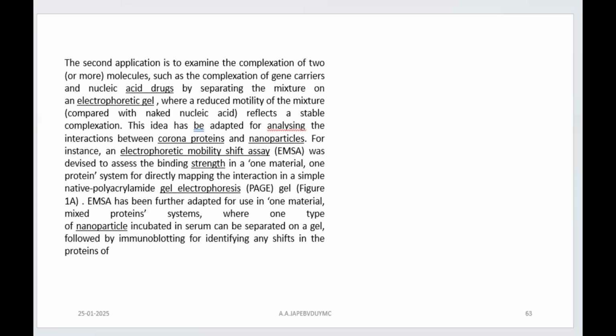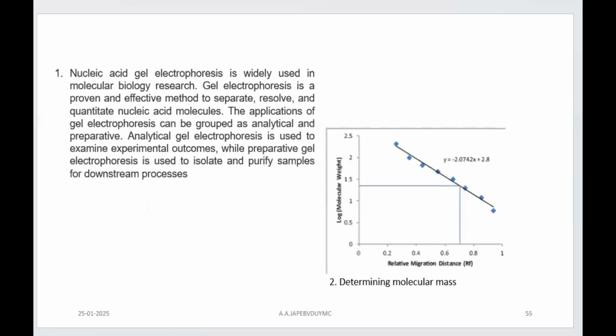When it comes to the study of applications to proteins, the very first one that we talked about was determining relative molecular mass, right? So you can find out the molecular weight of proteins by gel electrophoresis, where you are using reference proteins, finding out their mobilities and the mobility of your unknown protein, and comparing it on a graph.